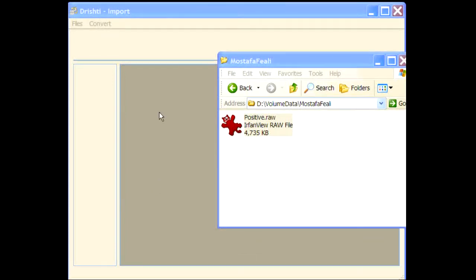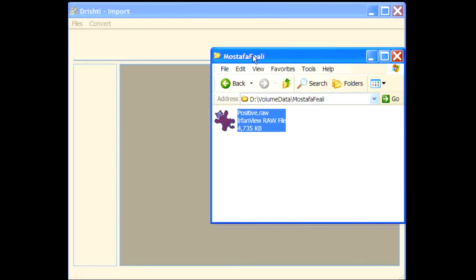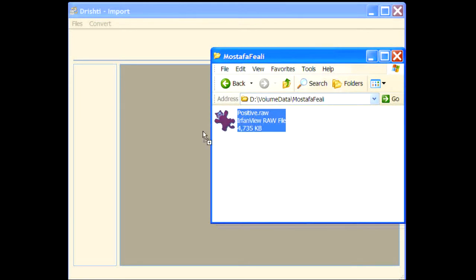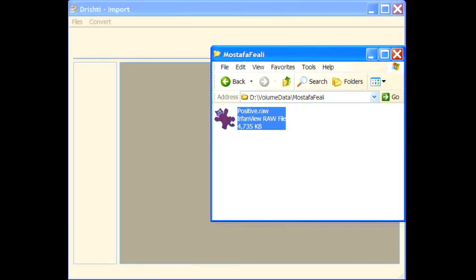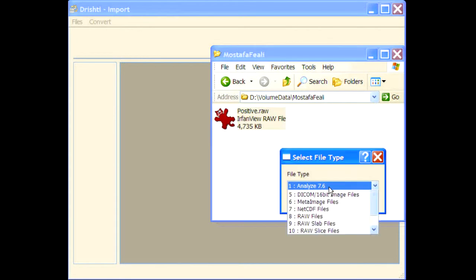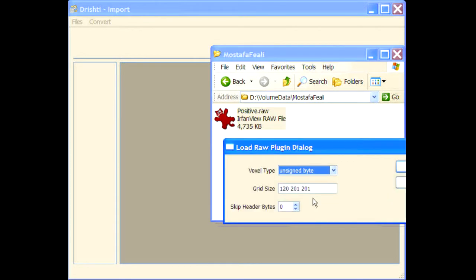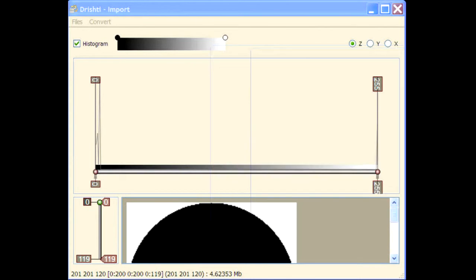Hi, so I'll show you how to load the segmented data. This is your data that you had sent me, so positive dot to raw. This is the raw file here, unsigned byte.